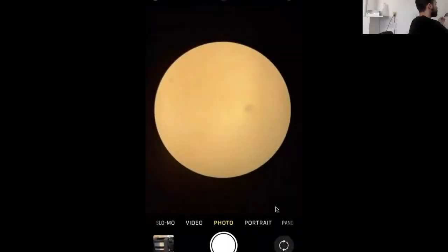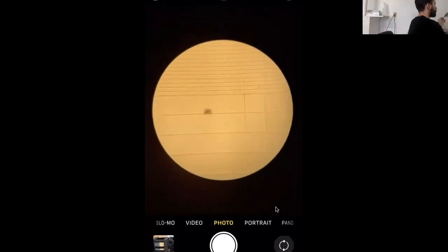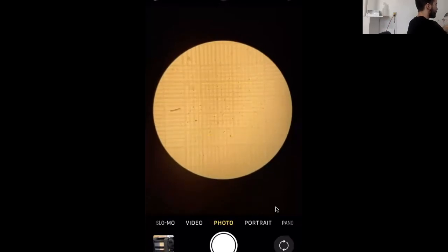Okay, let's look at the microscope, and we'll do that in a second. I'm going to switch over to my iPhone, which is plugged into my microscope using an optical piece, and we'll be able to view what's happening under the microscope on that hemocytometer. So these are the grid lines. We're going to zoom in more to really see what's going on.